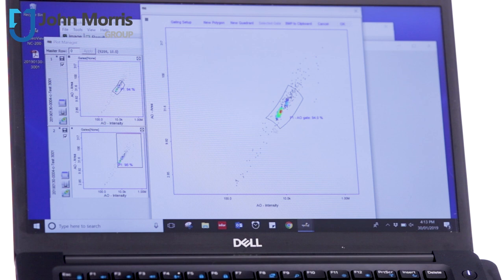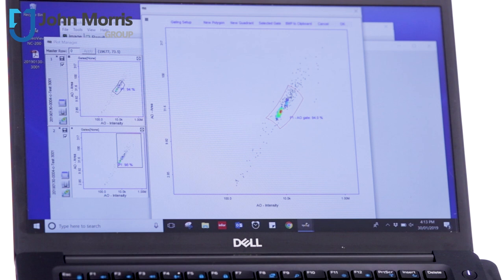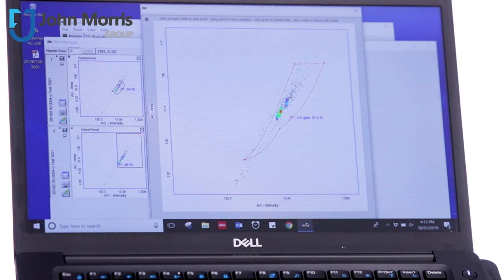Now this can be quite useful in case you have some debris hanging off either side, or there's an area of focus that you're particularly interested in. And if we wanted to change that, it's easy to do. It's really no trouble at all. And of course that will affect the nature of the results.